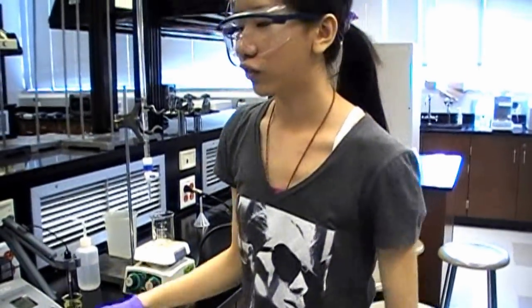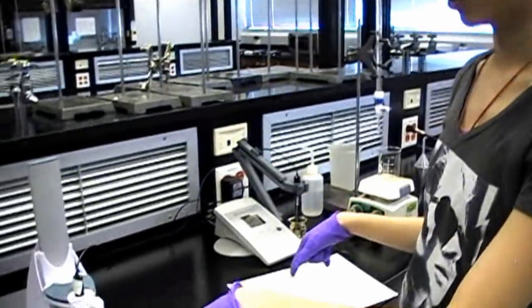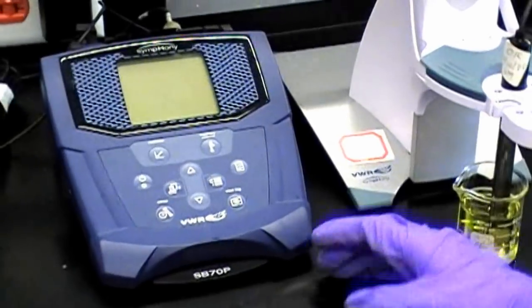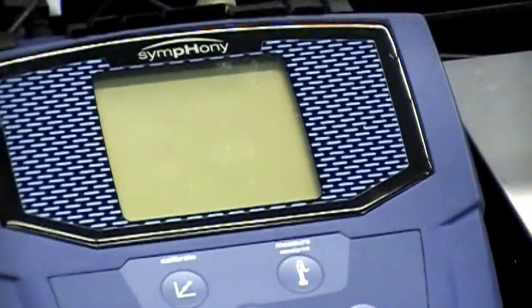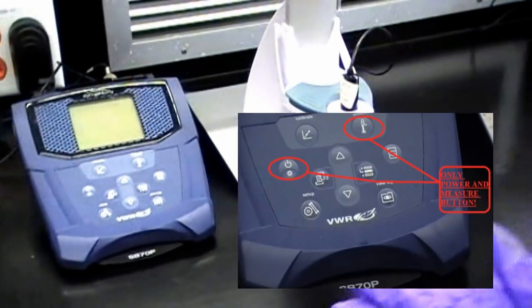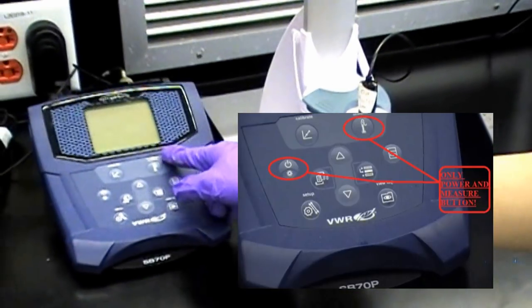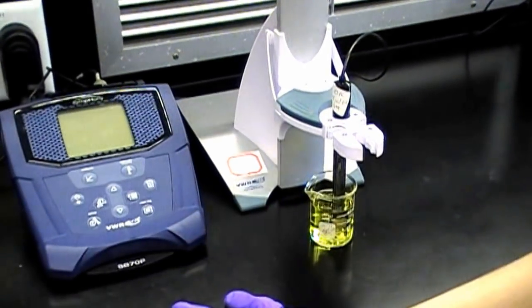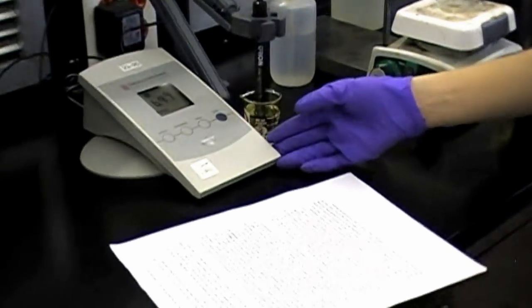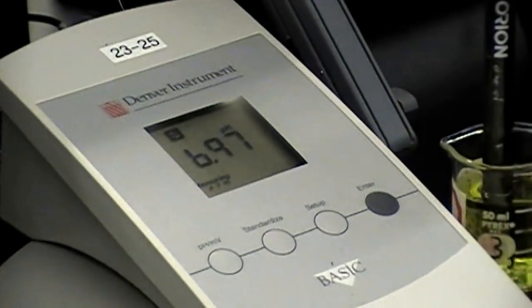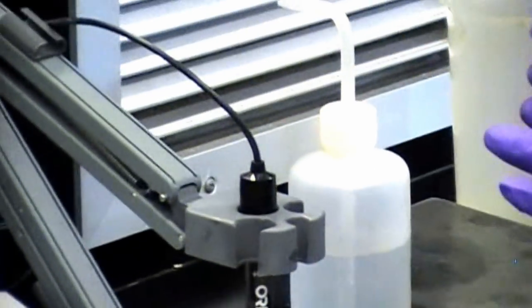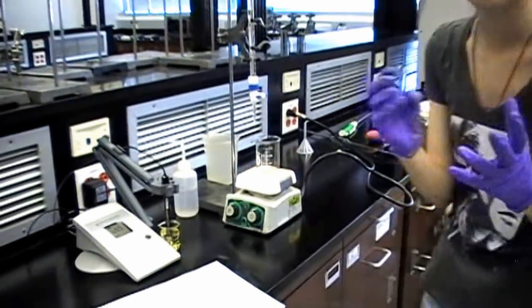We have two different pH monitors. In this one, you have to hit the measure button and the power button. Those are the only two buttons you'll be dealing with. You don't want to hit anything else or it won't be calibrated. But for this one, it constantly measures your pH, so all you have to do is clean your pH probe with deionized water and kim wipes.